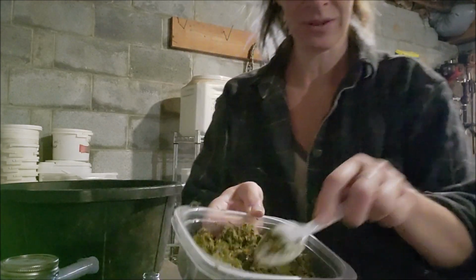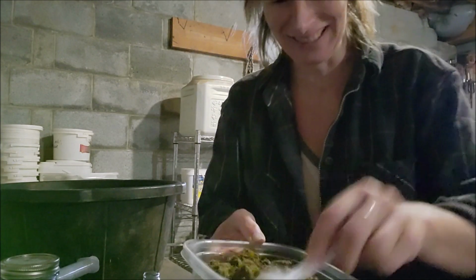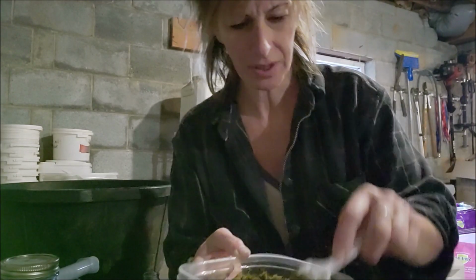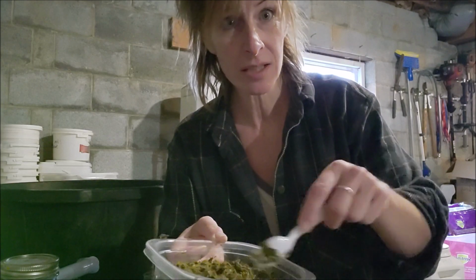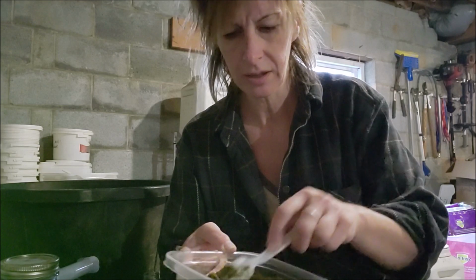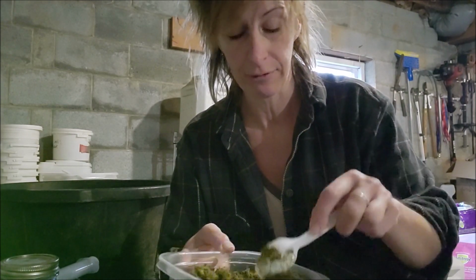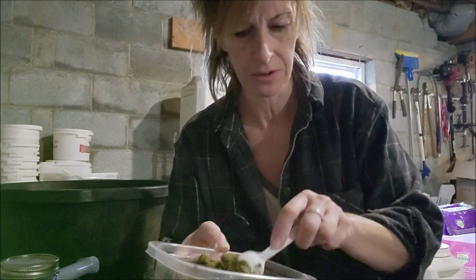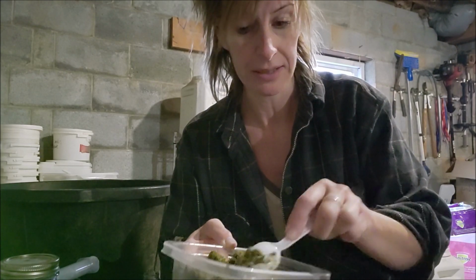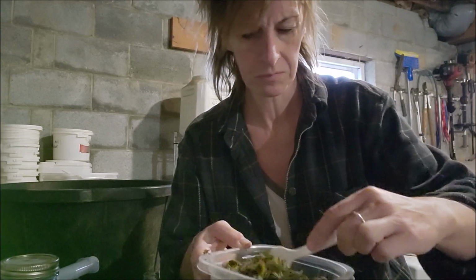All right, so this is now sufficiently mixed up really well. No. That's why we use plastic spoons. So this looks actually really super good. It looks like he's really digesting his food. It's a good color. It's not dark. It's not too wet. There's no funny stuff in here, like a lot of gravel or sand or anything. So it looks like his diet has been fairly good for the past couple days, which is good. So yeah.